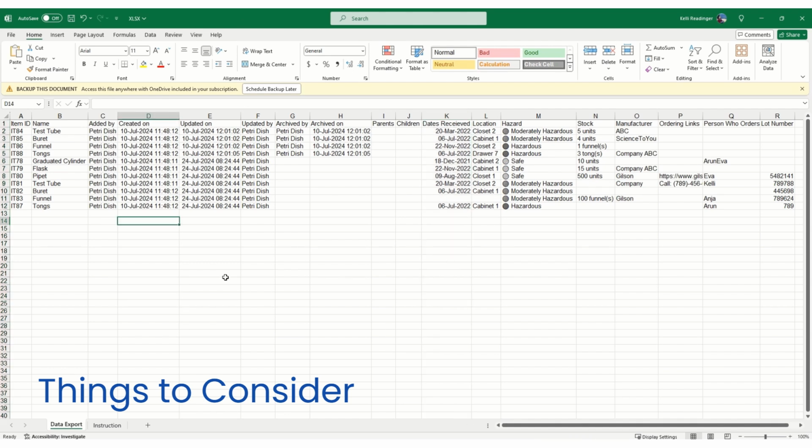Additionally, file columns, item relationship columns, and columns with the range setting for date and time, and so on, cannot be imported into SciNote via an Excel or CSV import.